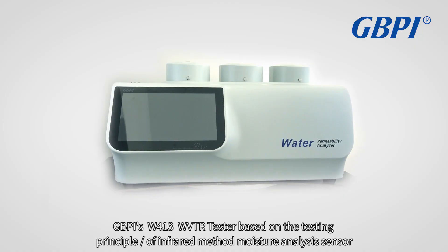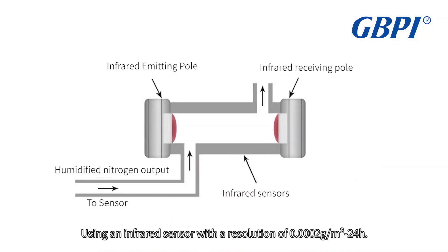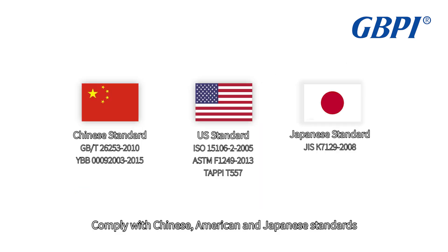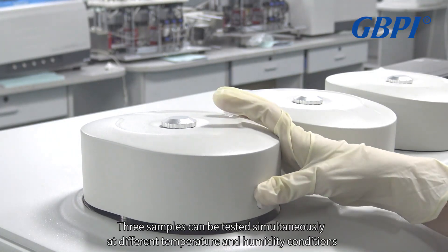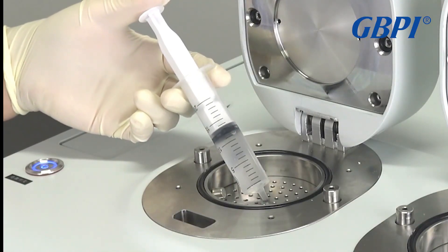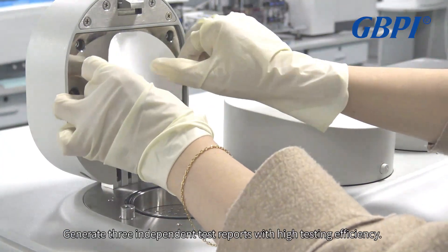WVTR Tester based on the infrared method moisture analysis sensor, using an infrared sensor with a resolution of 0.0002 G/M² per 24H. Complying with Chinese, American, and Japanese standards, the W413 has a free-standing three-chamber design. Three samples can be tested simultaneously at different temperature and humidity conditions, generating three independent test reports with high testing efficiency.